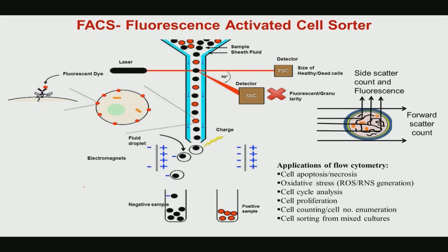Like in eukaryotic cells, one can also do precise cell fate determination for bacteria. As with eukaryotic cells, one can use the fluorescence activated cell sorter, which I described significantly when I discussed the cell fate processes. You have two things there: side scatter, SSC, and forward scatter, FSC. Now, what are the applications of flow cytometry?